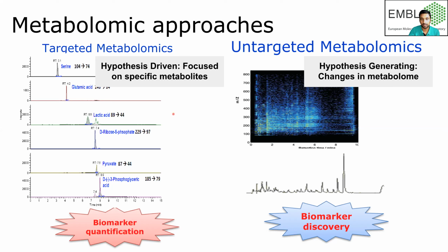So these are the pathways, or these are the metabolites, of your interest. You don't need to profile hundreds or thousands of metabolites. You can just narrow down on amino acids, for example, or central carbon metabolism, and then use a triple quad mass spec to develop methods only to detect those metabolites.